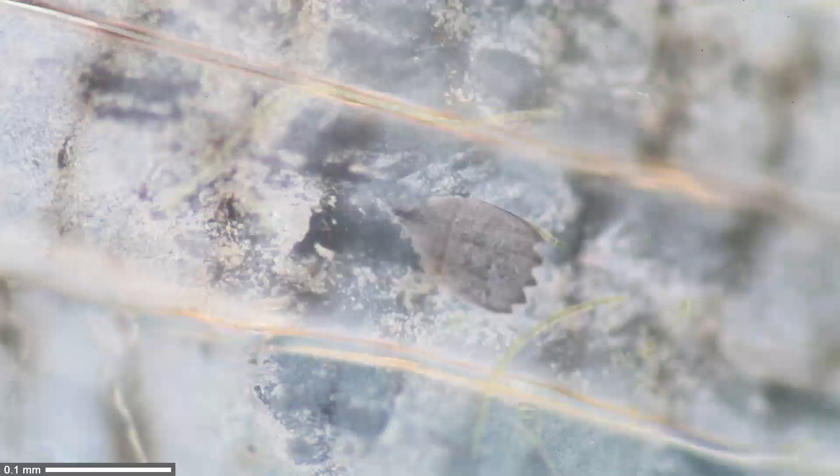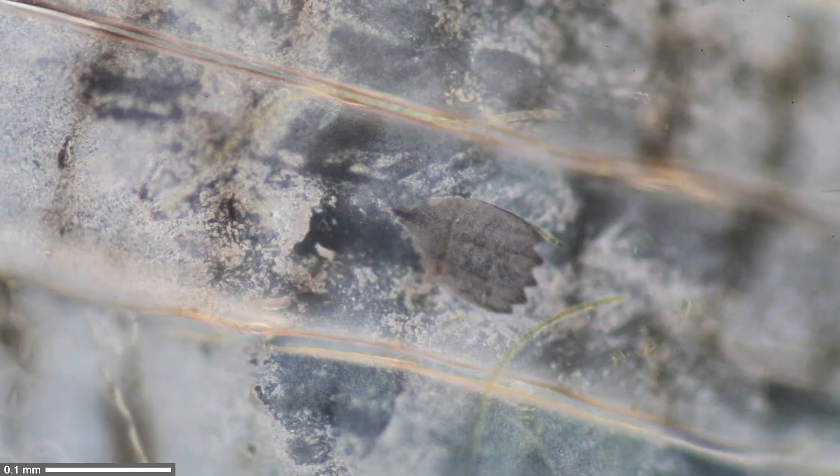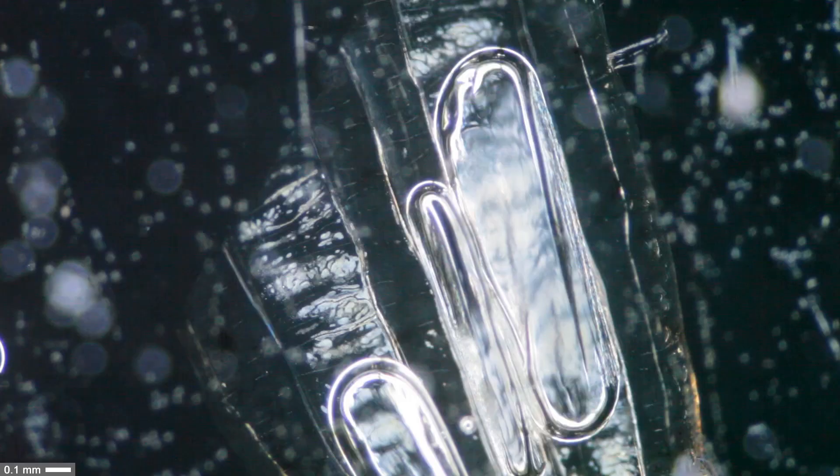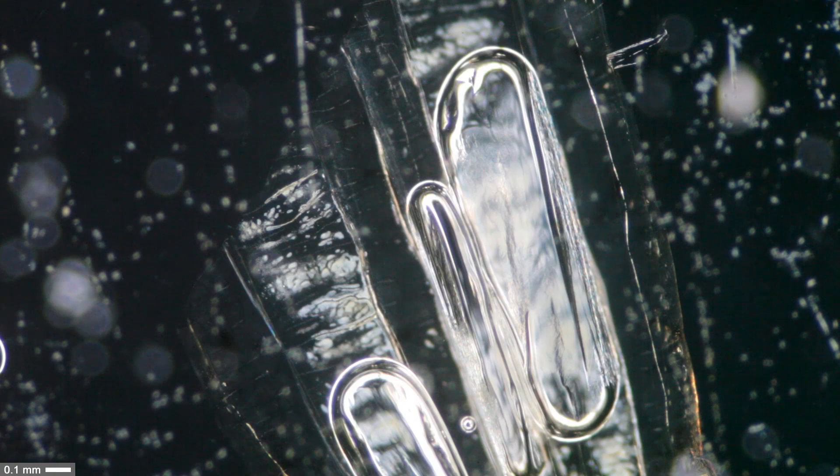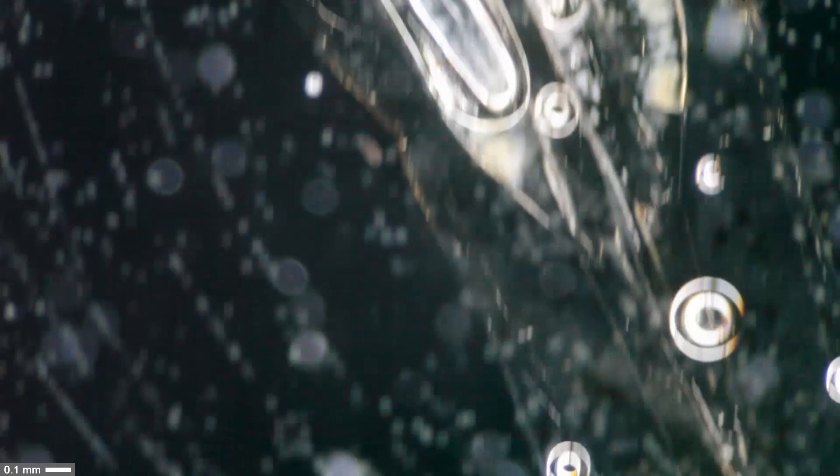Now I try dark field with the Euparal mounting medium, the transparent specimen. These are the air bubbles, very white, not so interesting. But the rest of the shell here is very difficult to see because of its transparency. What I see is all those white dots - that's all dust. Not very suitable, I think. That's it.